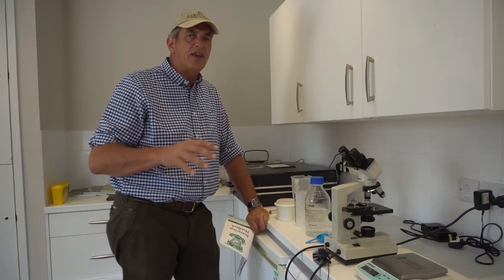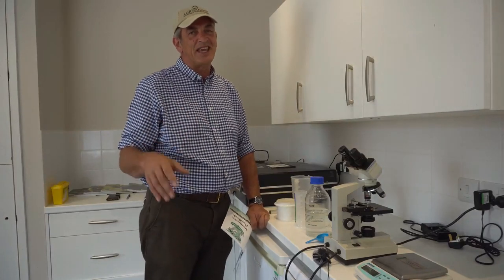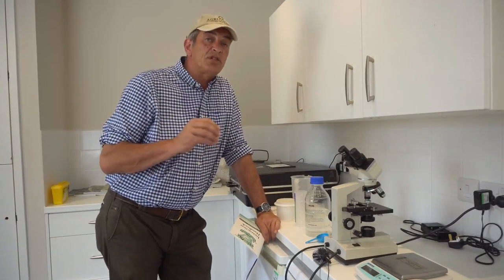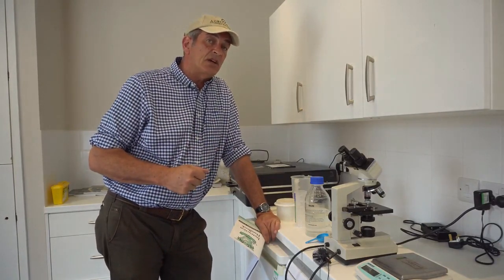FECPAC is a super simple thing — I'm not a technical person at all and if I can do it you certainly can. You get a very simple set of instructions in your book, and in fact you can go on a one-day course which is really interesting and shows you exactly how to use the equipment.